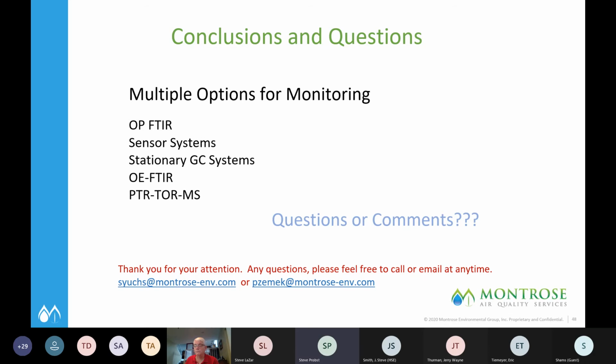What is the cost of this type of MS instrument? For the PTR, I believe it was $600,000 for the instrument alone. And the entire setup ends up in the very high 6 to low 7 figures to get everything outfitted and equipped the way that we have it. It's not a cheap mode. That's correct, Steve. Yeah, we can build a van for about $800,000 fully equipped.